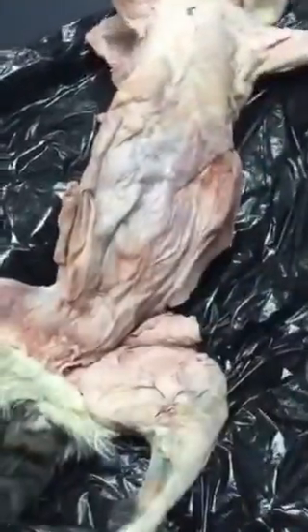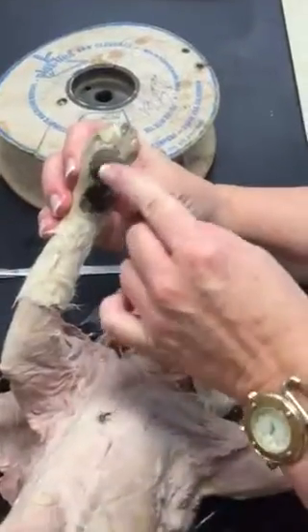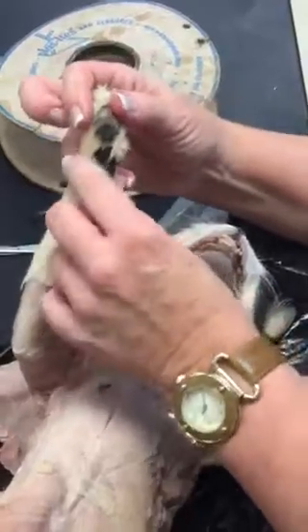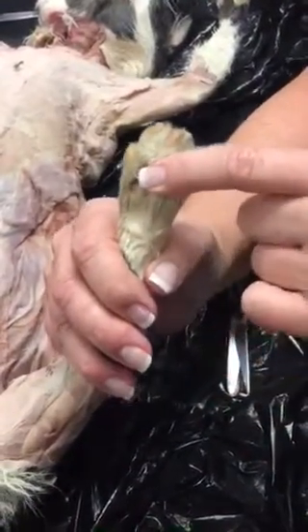The front paws we call manus. The back paws we call pes. The toe pads on manus are torus digitalis. The palm pad is torus metacarpalis. And then at the wrist, we have torus carpalis. On the pes, the toe pads are called torus tarsalis, and the foot pad is called torus metatarsalis.